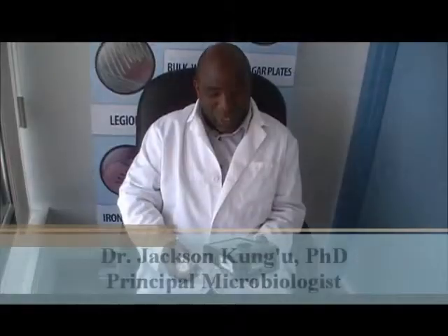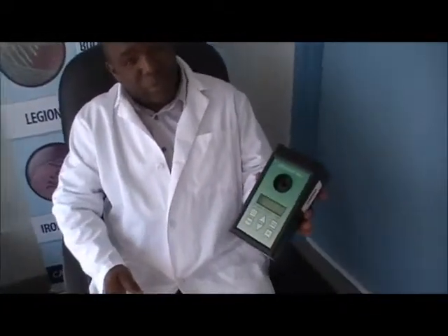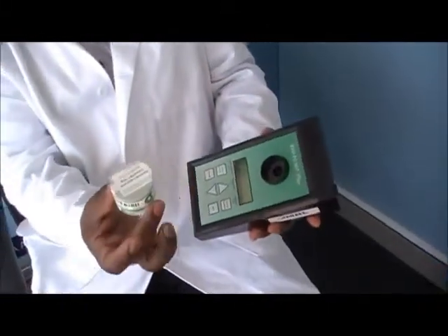To explain how to take an air sample — it's very easy. All you need is this kind of pump which will suck air into this kind of cartridge.